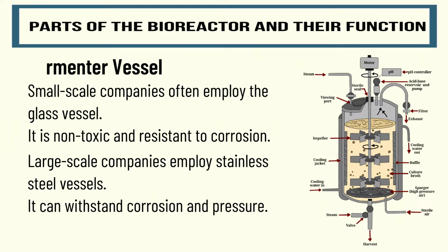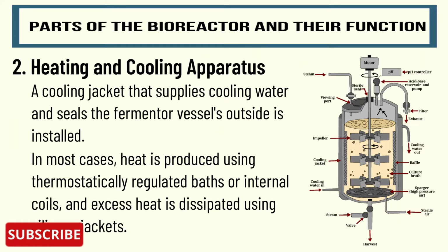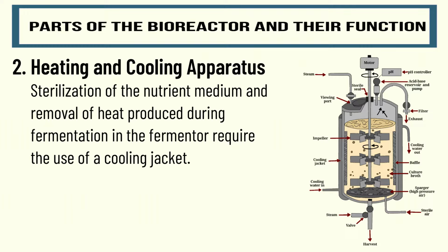Second, we have heating and cooling apparatus. A cooling jacket that supplies cooling water and seals the fermentator vessels outside is installed. In most cases, heat is produced using thermostatically regulated baths or internal coils, and excess heat is dissipated using silicone jackets. Sterilization of the nutrient medium and removal of heat produced during the fermentation in the fermentator require the use of a cooling jacket.